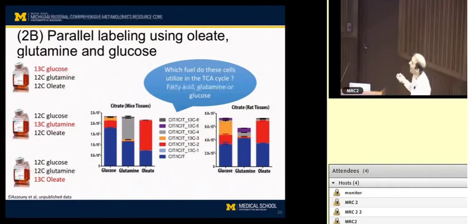And a good panel, this technique sort of was popularized in our lab by Mahmoud, so thanks to Mahmoud again, is to use 13C glucose, 13C glutamine, and 13C oleate, or another free fatty acid, and to create a media containing all 3 of these things, but only one of them labeled at a time, and then expose your cells to these 3 different media and observe the patterns of flux at similar time points using these different media compositions. And that way you have competition, right? The glutamine concentration is the same in all 3 of these media, so the cells have the option to choose it if that's their preferred substrate, but you'll only see the flux that's coming from the tracer that's labeled in that study.